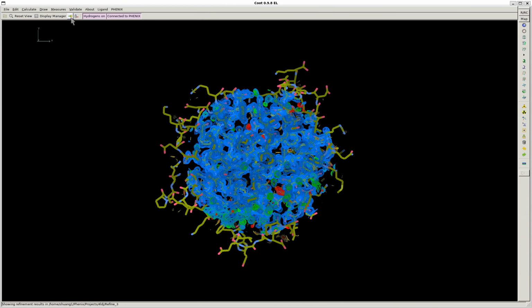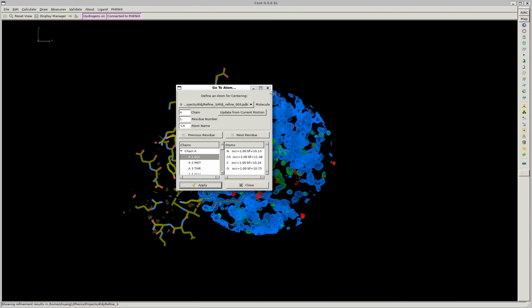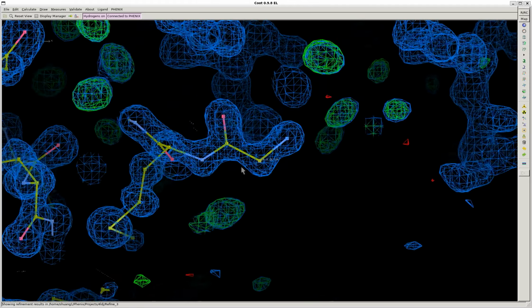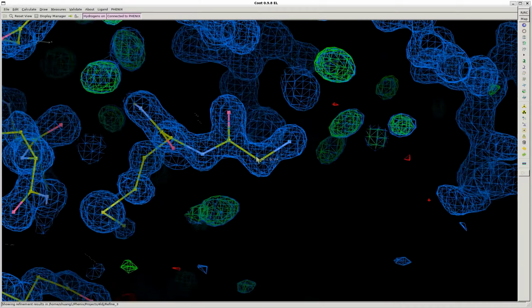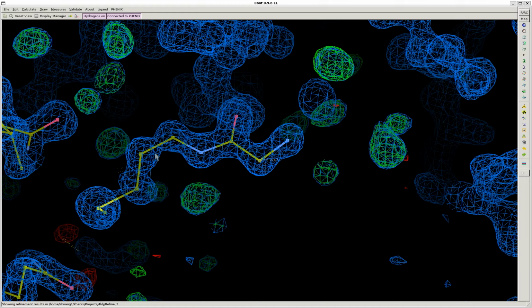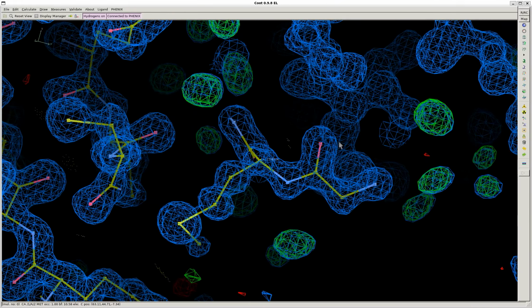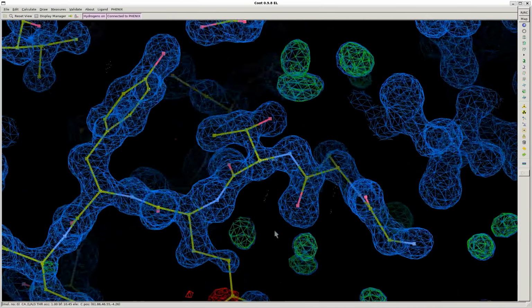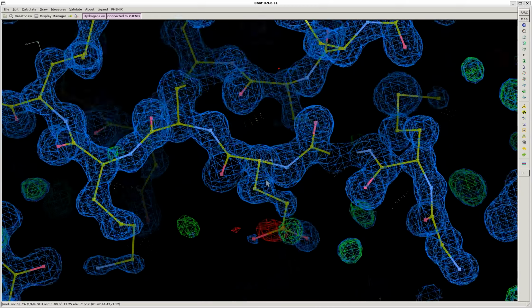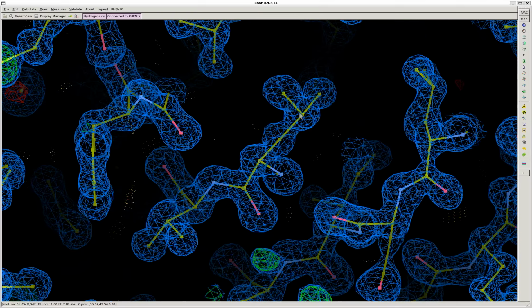We can go to chain A and see if anything changed. Zoom in. Wow, now it fits nice and neatly into its electron density map much better than what it originally was. Disulfide bonds, the sulfurs, fit perfectly in the electron density map. All of these look very perfect. This looks great. Looks great. This part got fixed. It originally had a green area, now there's no green left.